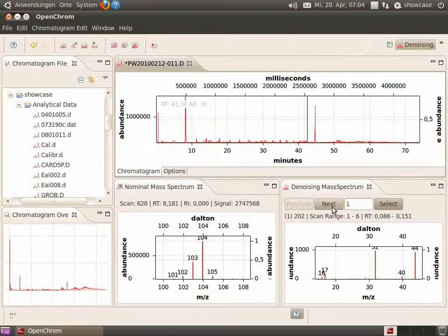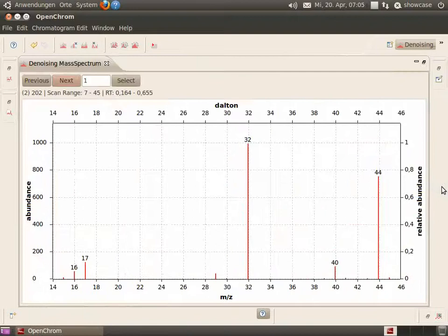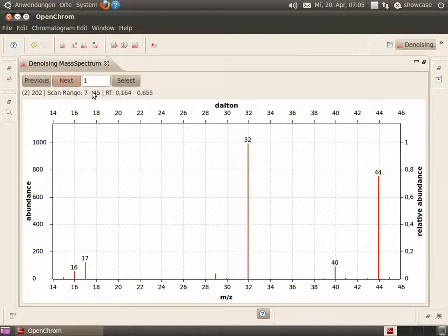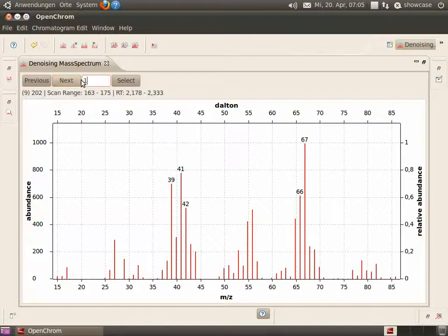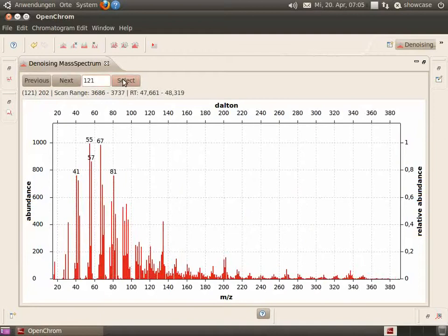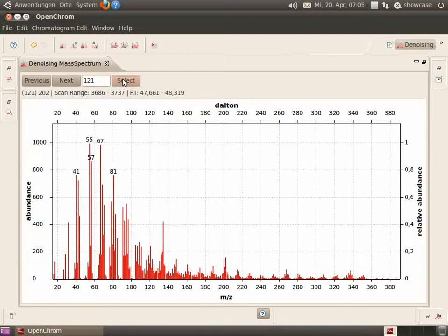The next filter we would like to apply is the Savitsky-Golay filter, but before we can have a look at the mass spectra that have been used to denoise the chromatogram. You can see we have 202 mass spectra which have been calculated and we can select each mass spectrum we like to see.